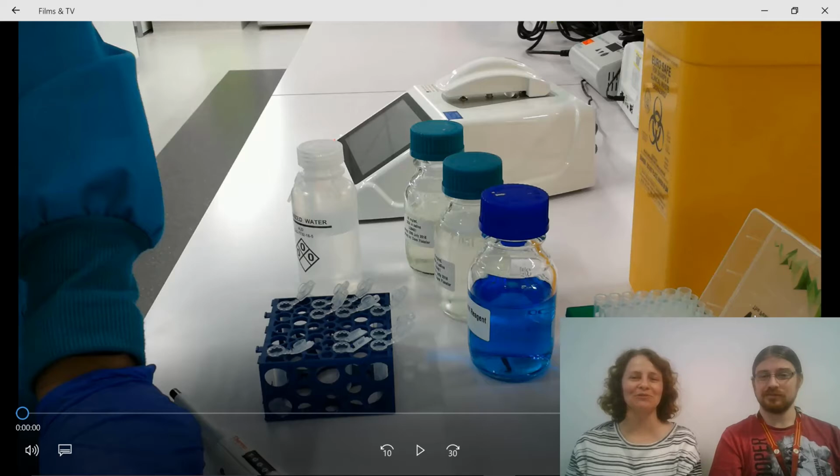Our lab technicians were really kind and they let us film them while they were setting up for the prac. And you can see here they've got all of their bottles out, they've got their tubes, they're all labelled, and so everything is ready to go. They've got their pipettes already prepared, they've got their tips sitting out. So now we'll watch them set up a test sample.